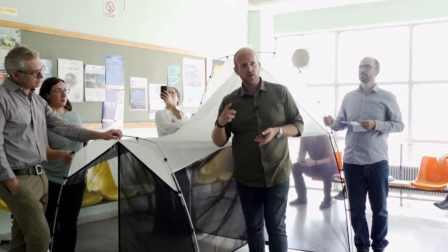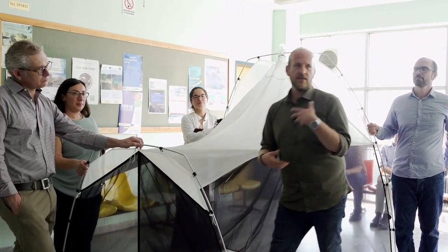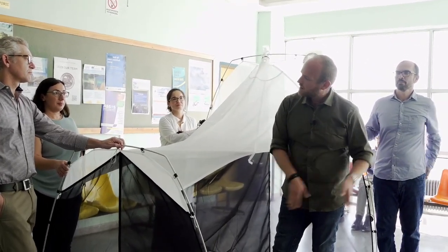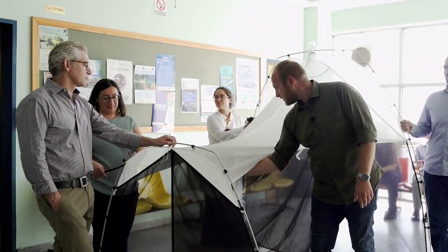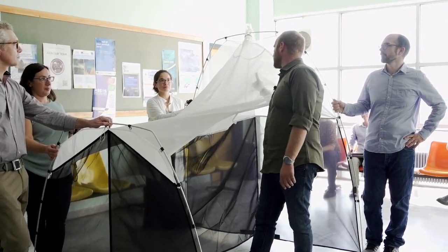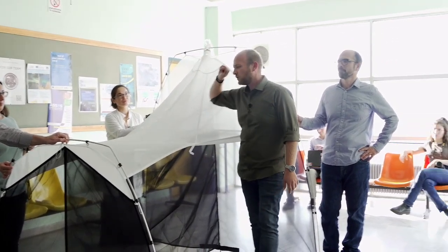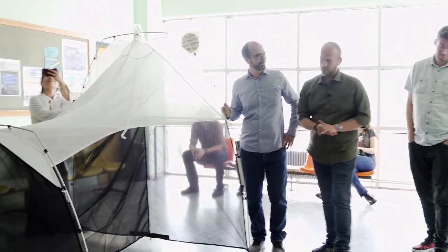You can put the small light somewhere here, and in the night it will also attract the insects, so you have attraction from the light, and when the sunlight comes out, they will walk and fly to the gap here and be in the bottle. That's all. That's a Malaise trap.